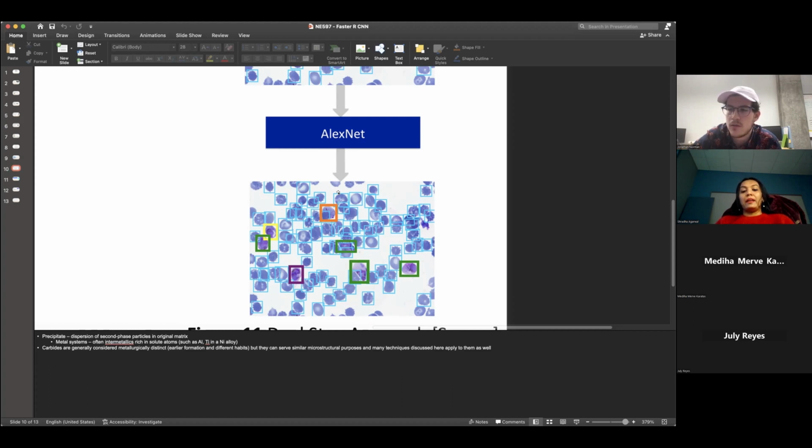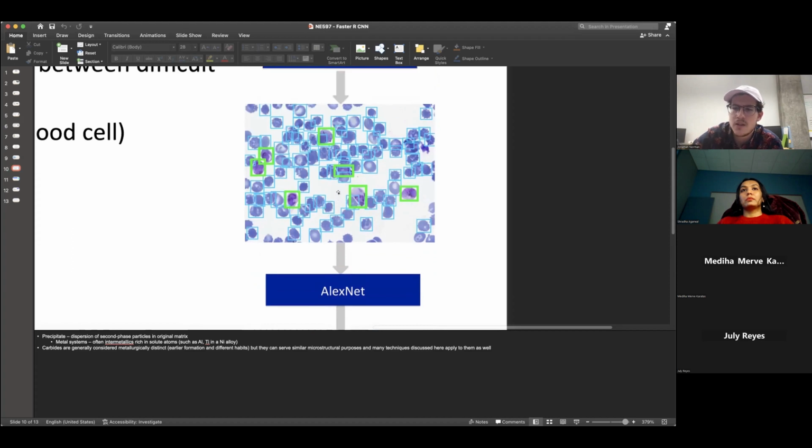And if we apply this faster RCNN to our bubbles data, what do you think? Do you think that we would do a similar approach, applying AlexNet and faster RCNN, or it could be directly applied? I don't see why the second step would be necessary, because as demonstrated here, faster RCNN did an excellent job of identifying a binary yes/no criteria.